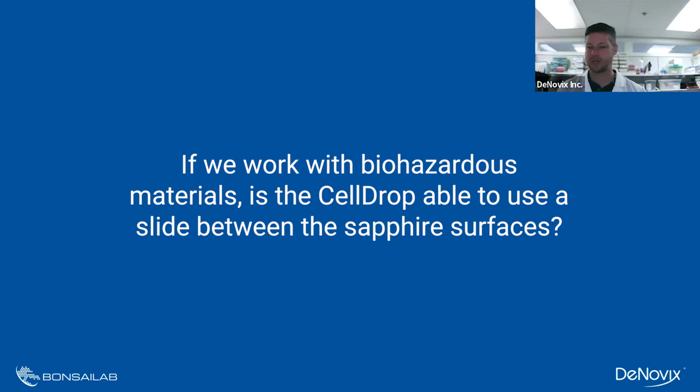Not like a traditional quartz hemocytometer, but a disposable slide will fit in there if you're working with something that's biosafety level 2 or 3 or even higher, and really don't want to have any contact or any contamination of the CellDrop.